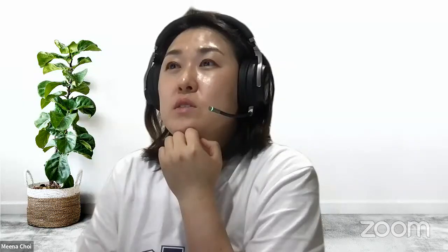I just found it in TMT, so it's definitely in TMT. I thought that it used base MSstats functions, but maybe it doesn't. Yeah, it's definitely in TMT though. Yes, TMT, OpenMS. Maybe the team will give the right answer tomorrow. Yeah, Spectronaut, yeah, Philosopher, yes.